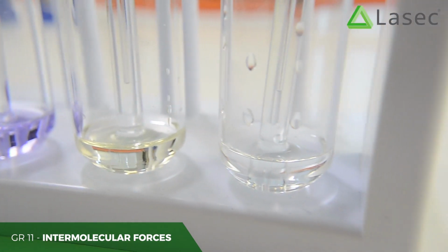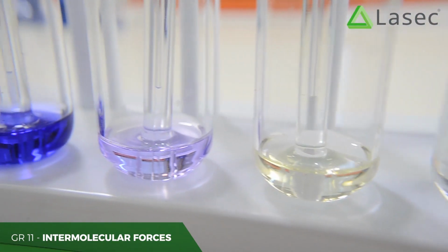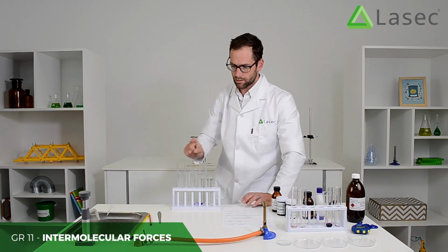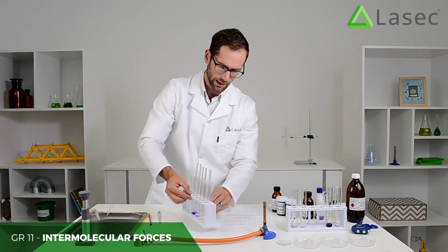For example, the glycerine is not entering the tube, so the methylated spirits has definitely gone up the most out of these. The others are similar, apart from the glycerine, which has hardly come up. Actually, it hasn't come up at all, maybe a tiny bit.